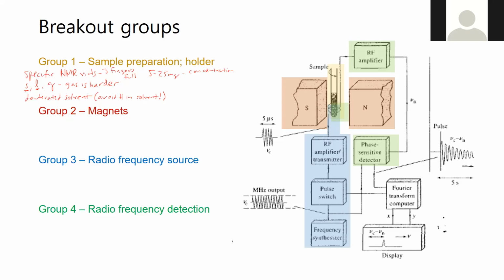After that, you cap off your sample and put it in this sort of spinner, which has a hole in the middle. Anytime you're running an NMR, you'll see these spinners. They typically come with some tube or guide that shows where on the sample tube the spinner should be located, as far as how high up.